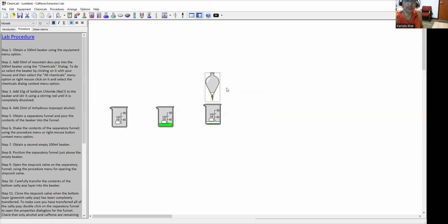Now, if you see that there is again a little layer, then you use the separating funnel again to separate it out. And so if that is the case, then you close the valve and then go back and pour and decant and let it go again.